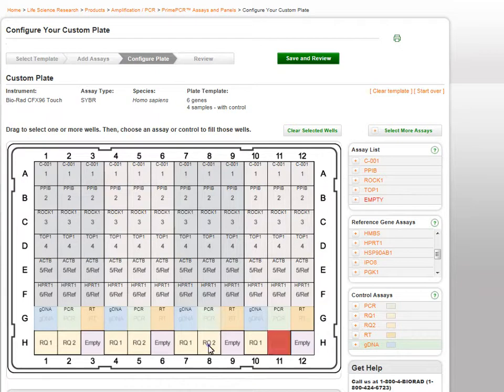When using the RNA Quality Control Assay, you are required to use RQ1 and RQ2 as a pair.